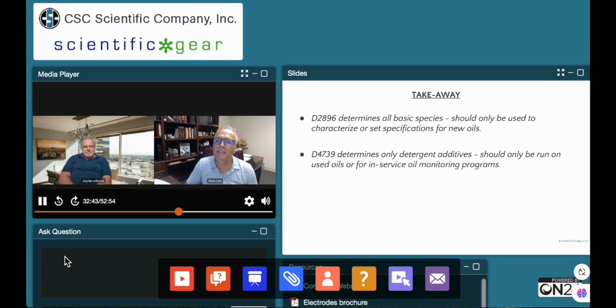ASTM 2896 determines all basic species. It should be used for characterizing specifications for new oils. And ASTM 4739 determines only the detergent additives and should be run for used oils or for in-service oil monitoring programs. So, all right.